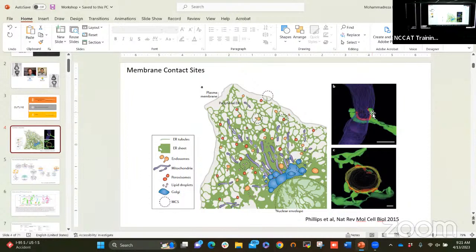Did anyone ever detect fission, like moving? With fluorescence, yeah. I cannot even find a 3D image of mitochondria in the literature. Maybe you should look into 3D volume images, like slice and view or FIB-SEM volumes.